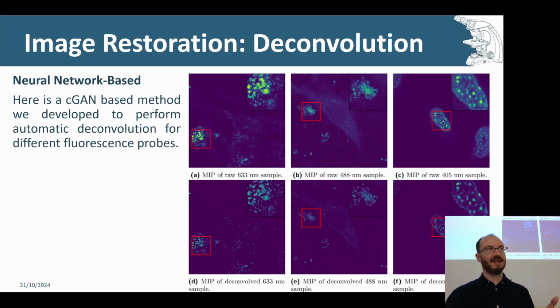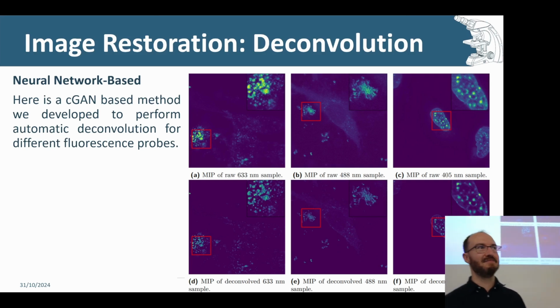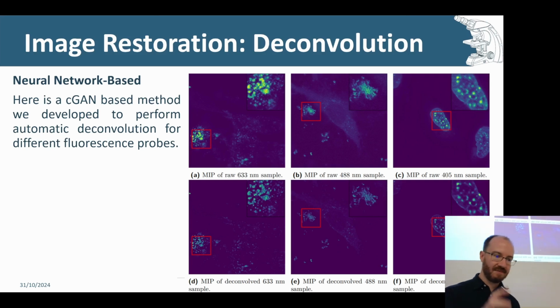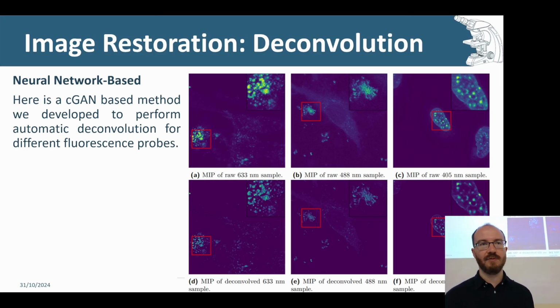So it's usually a good idea to normalize all the images to the same range at the end of the day, do some contrast stretching or something, to say, okay, consistently, I have shifted these intensities to be within a range that I know and understand. But it becomes a bit of a challenge, because when you're toying with intensities, you are possibly changing your data. So deconvolution is a messy operation. It's not as clean as you might hope it to be. And there are some subsequent considerations of how to redistribute my intensities to be sensible for analysis.